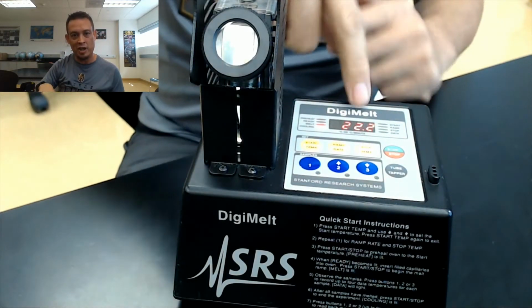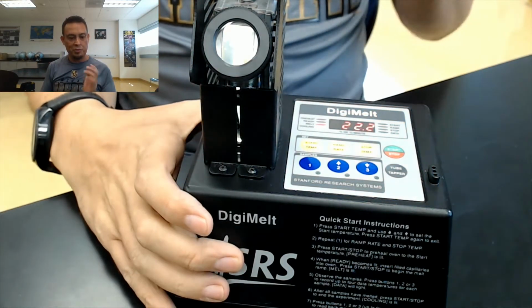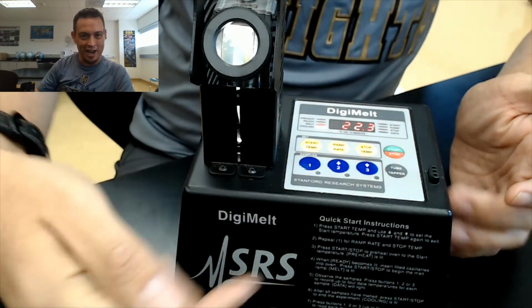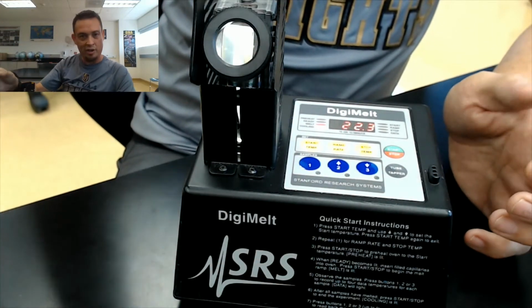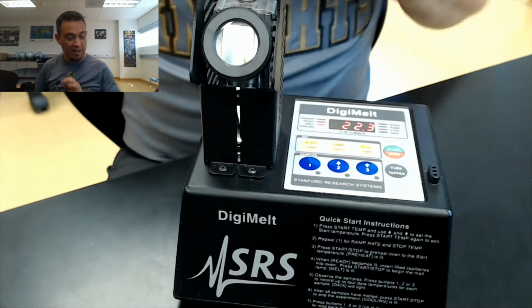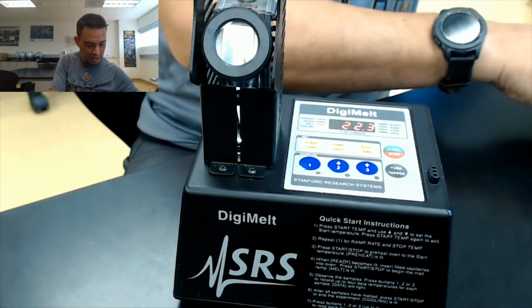And the particular melting point apparatus I'm using here is programmable. So if you have a non-programmable one, there's literally just a turn dial on there that you just load your sample in, and then you just turn the dial up slowly as you see fit, and then watch the thermometer climb. It isn't all that much different, honestly, with a programmable one, but I'm getting ahead of myself here a little bit.